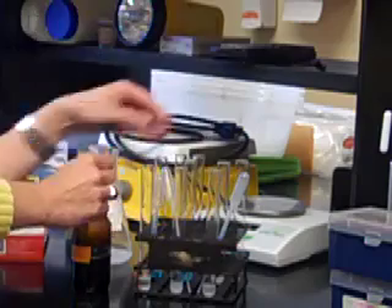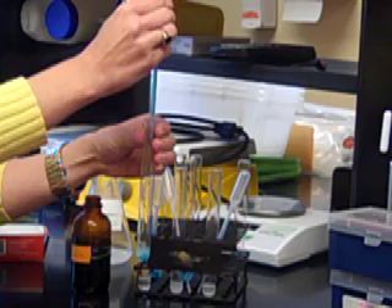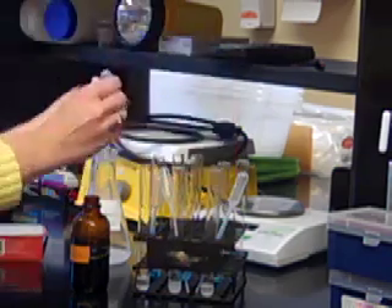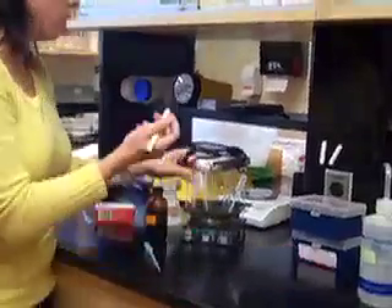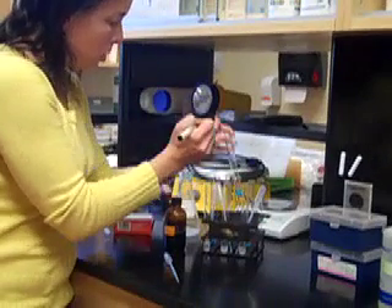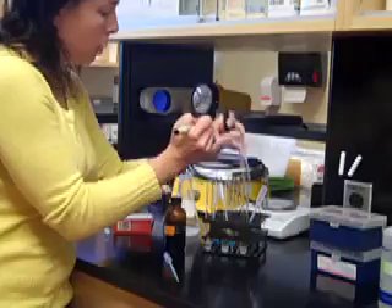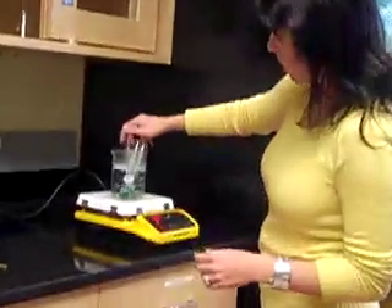It won't actually change any color until we heat it. So I'm going to take the test tubes. I want to make sure that I label them with a one, two, and three, because otherwise I won't know when I'm done. And I'm going to put them in a boiling water bath. If they're positive for monosaccharides, they're going to turn orange after about five minutes. So I have my hot water bath over here — I'm just going to stick them in and we'll go back and look at those in a couple minutes.